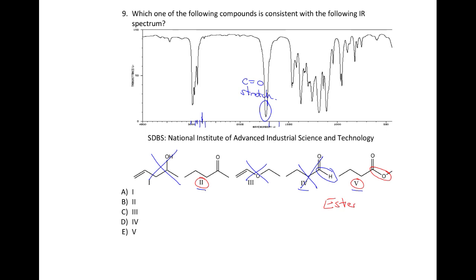For an ester, the CO stretch, not only do I see it between 1,300 and 1,000 reciprocal centimeters, but it's also very strong, or it's usually strong. So I'll put that. And you can see I have, here's 1,000, so here's 1,100, 1,200, 1,300. And you can see that I have a couple of really strong stretches here. So one of these for sure is going to be responsible for the carbon-oxygen stretch that's present in an ester.